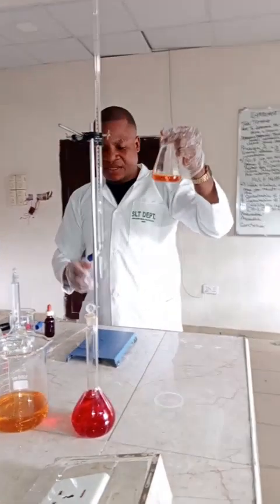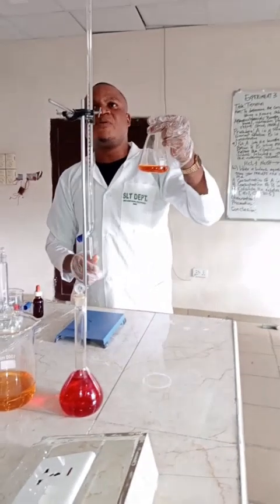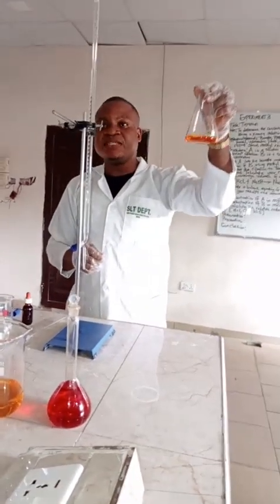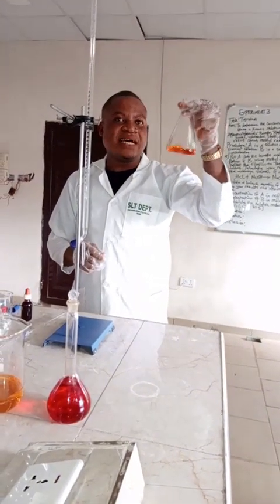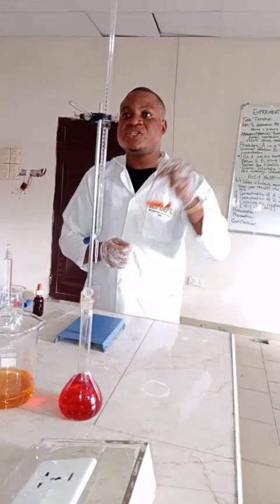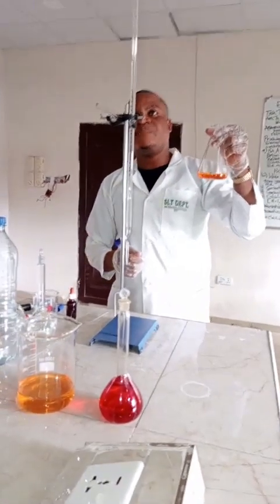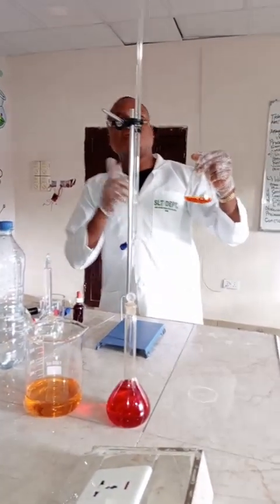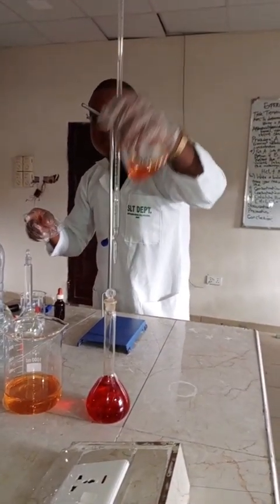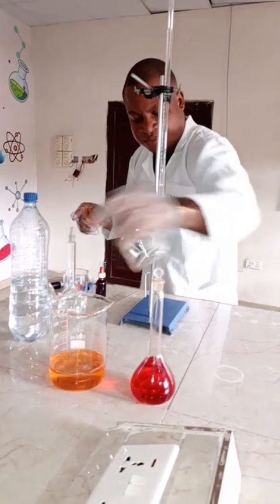These are our endpoints, quite different from what we had at the start. This is our endpoint. There is a color change. It shows that neutralization has taken place. Are you following? Now, from the rough reading, let me just discard this into here.